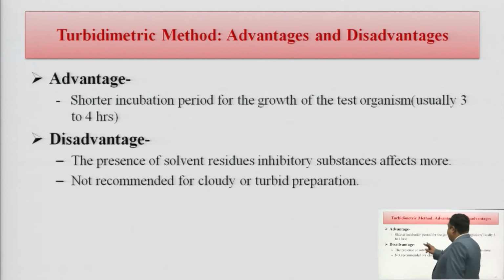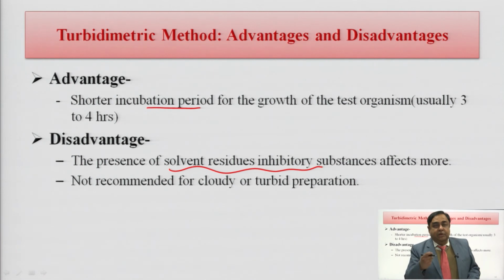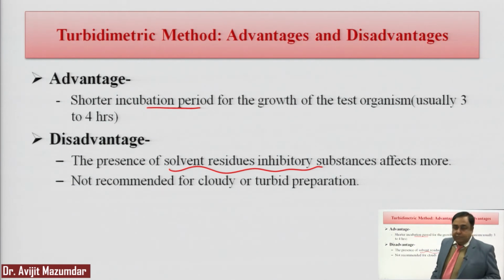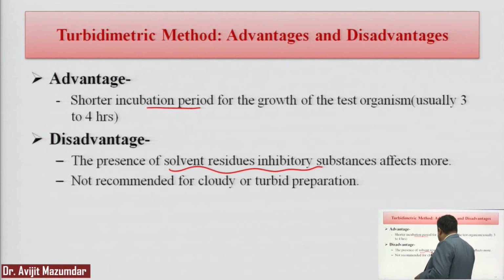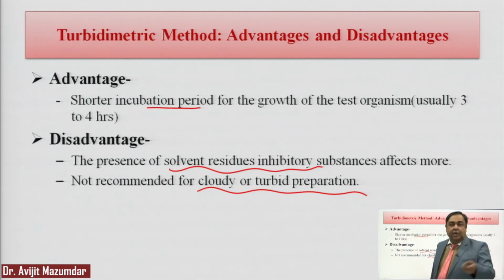Advantages: it has a shorter incubation period, so you are in a position to tell the results within a maximum period of 3 to 4 hours. Disadvantage: as I have told you, if there is any solvent inhibitory substance or if there is any particulate impurity, it becomes very difficult to predict whether the turbidity is due to the particulate matter or due to the presence of the microorganism. Therefore, this method is not recommended for those preparations which are generally turbid by themselves or which make the media cloudy.